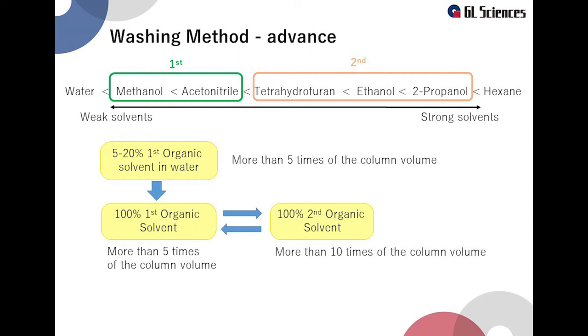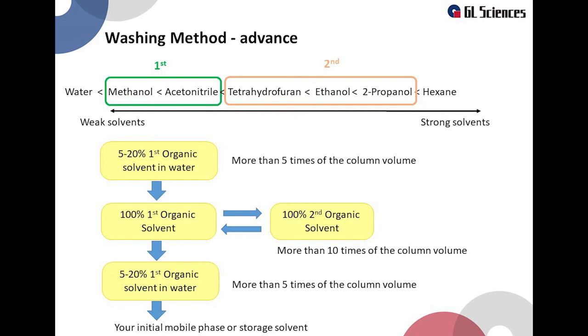Then return to the 100% organic solvent of the first choice. Run this again with 5 times the column volume. Then return to the mixture of organic solvent and water, and let it flow for at least 5 times the column volume. After that, use the column under the usual analytical conditions and check whether the column has recovered or not.